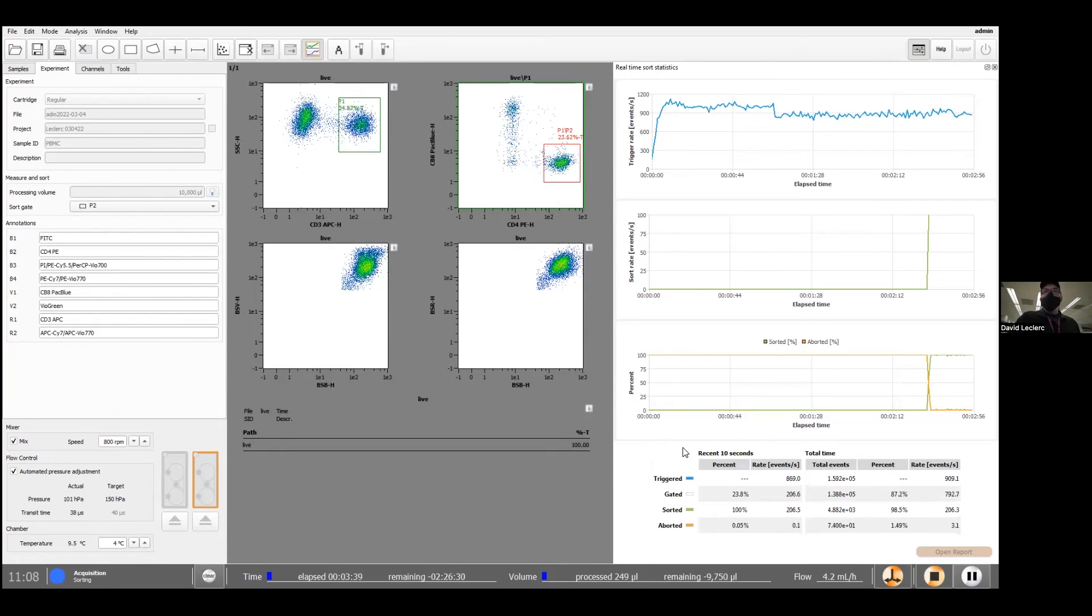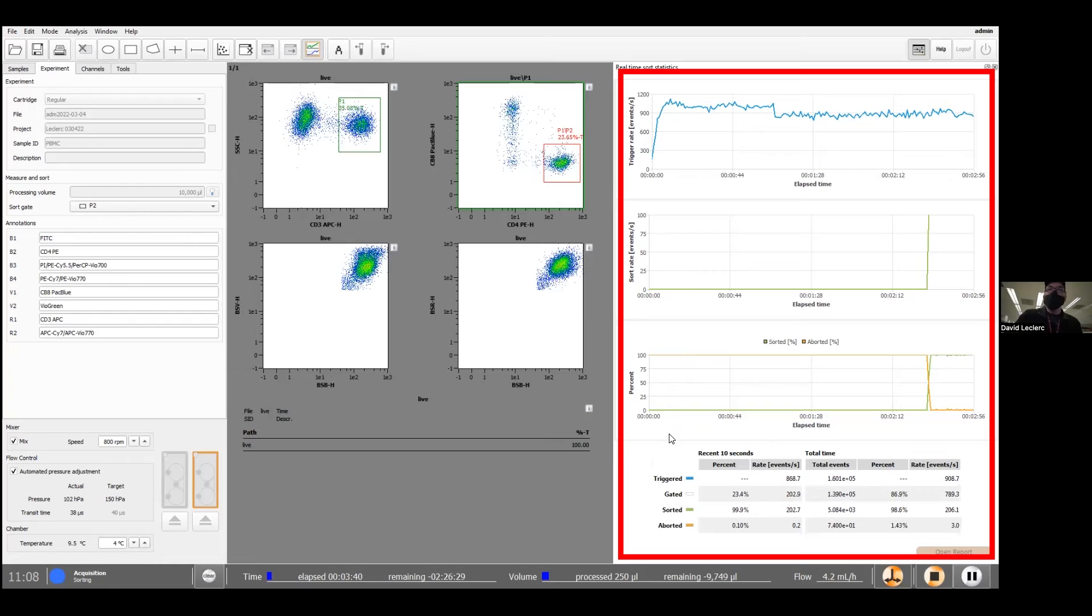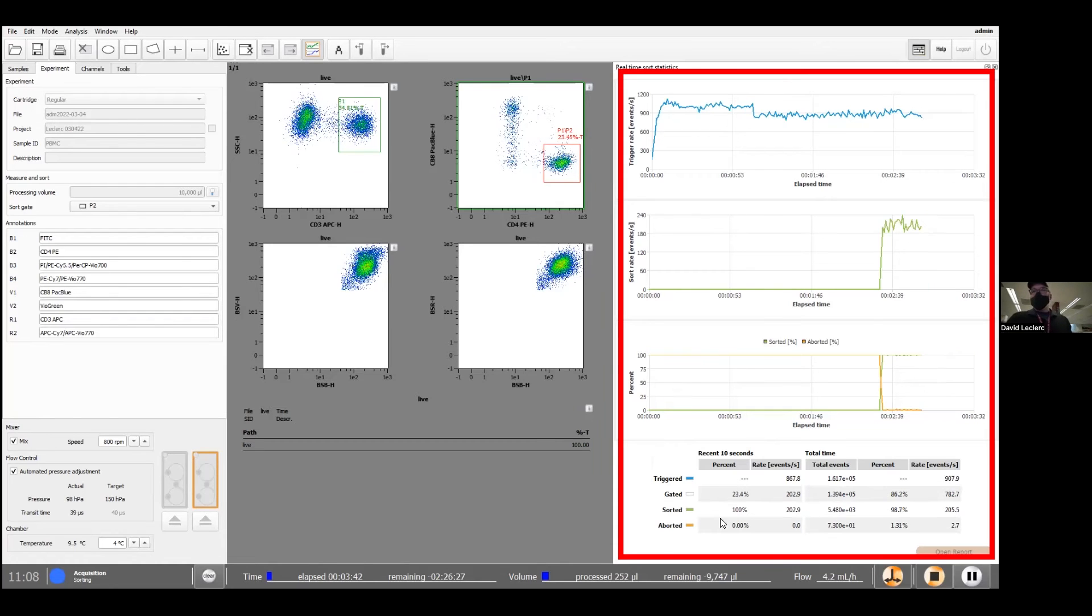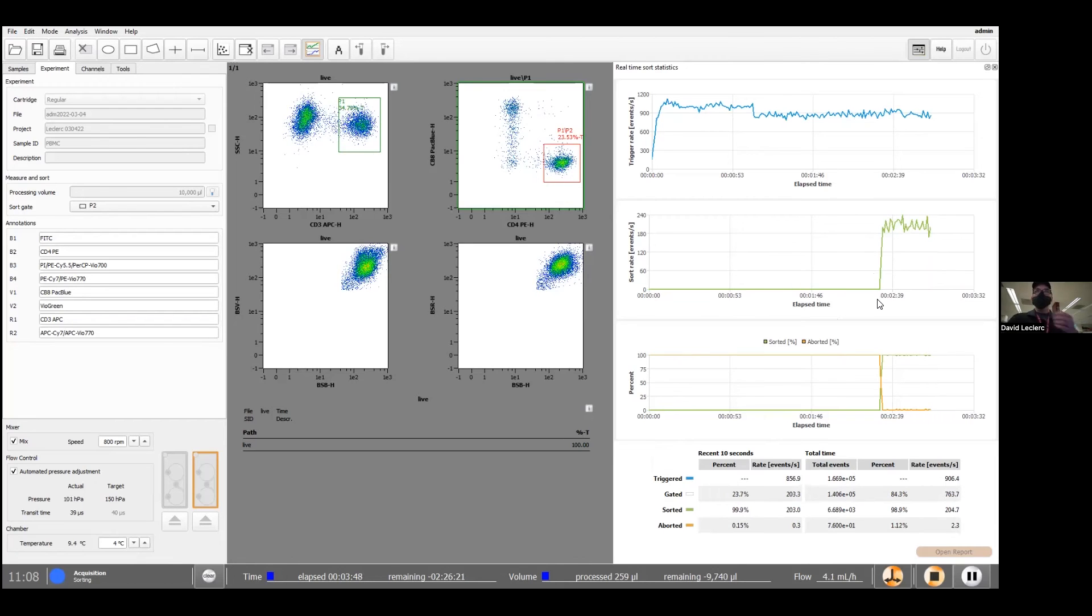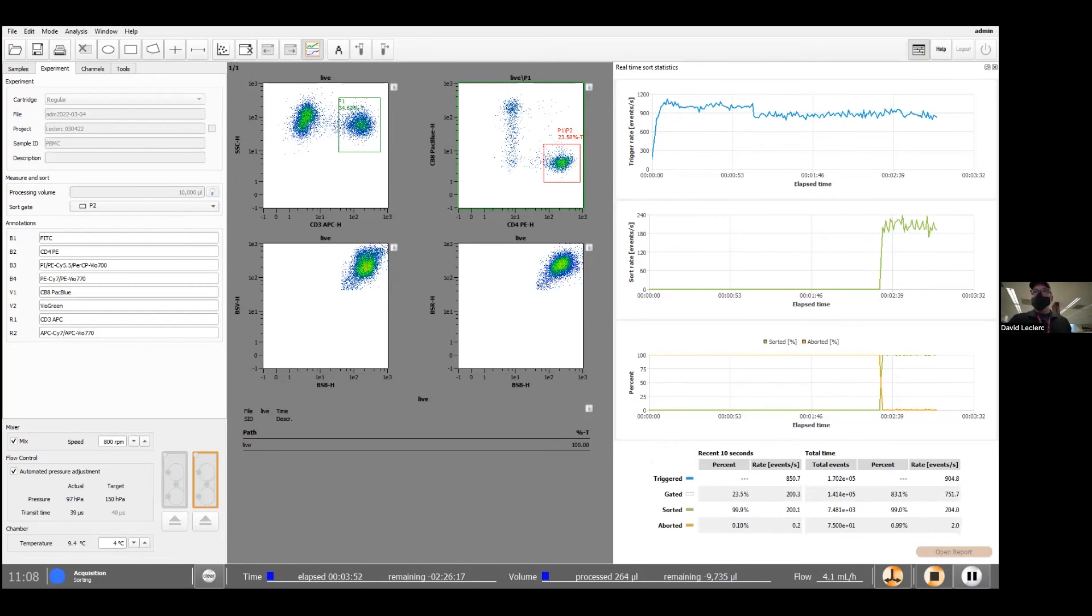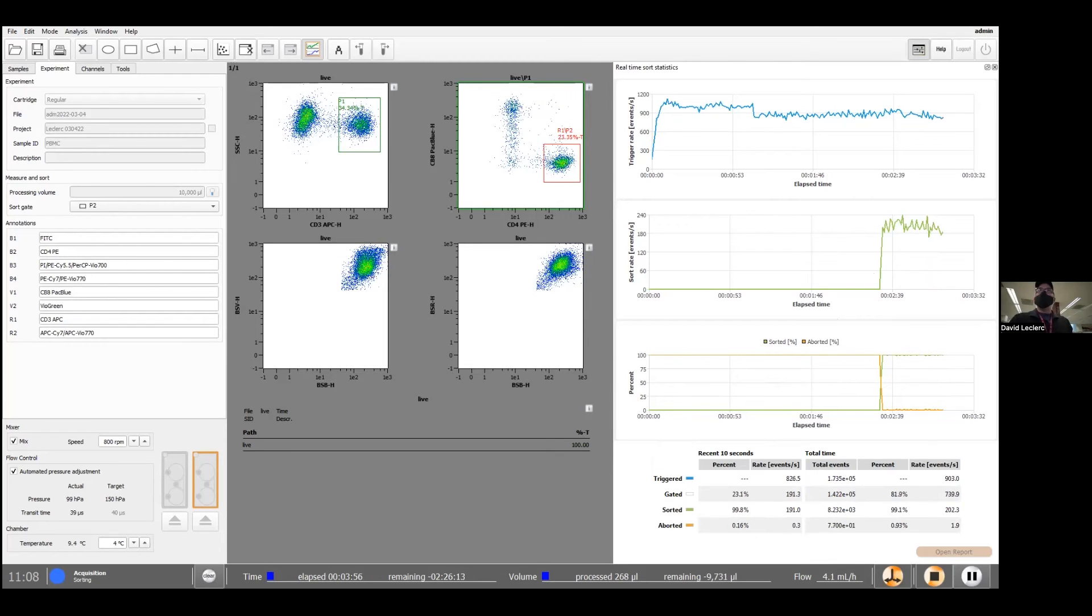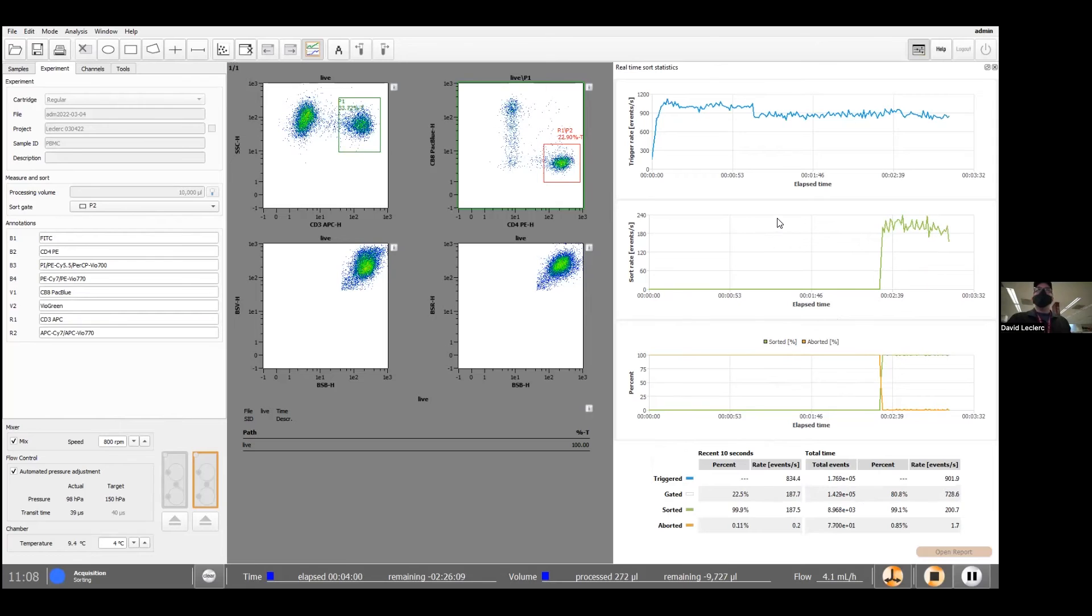And right away we can see over here, the statistics for the sort start populating this table. I have a graph that tells me how things are going. And so the efficiency of sorting is really high. There's very few aborts. This sample, to be fair, is very few cells in about 2 mL of sample. So I'm expecting everything to look really, really good here.